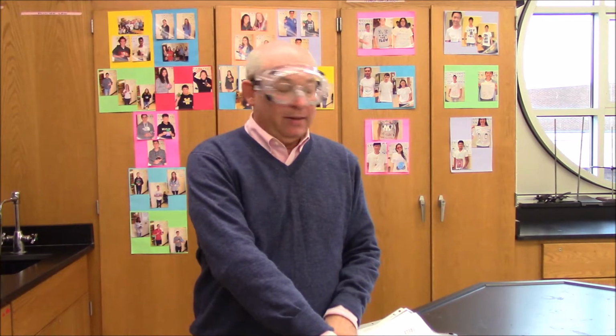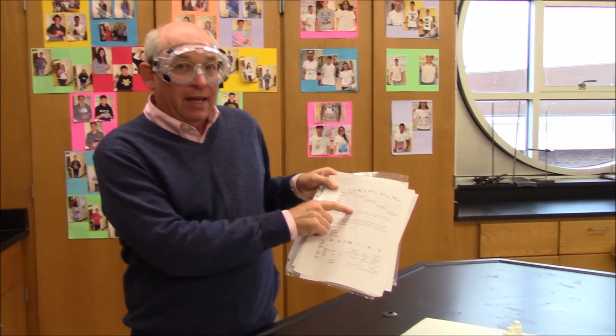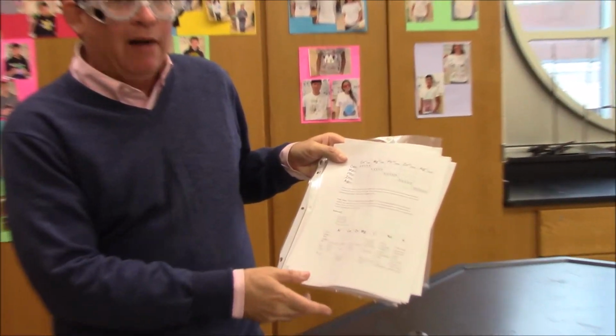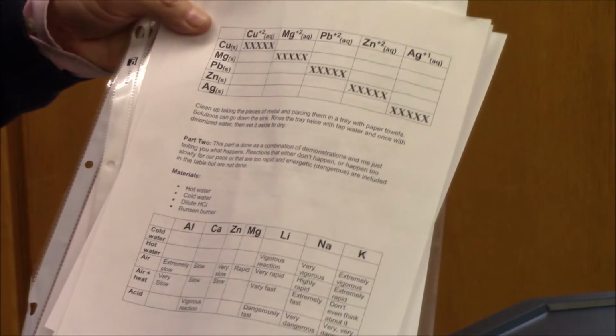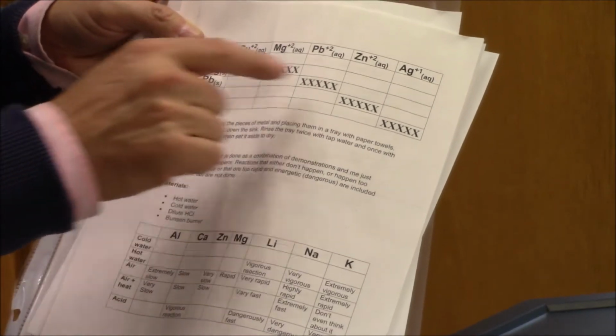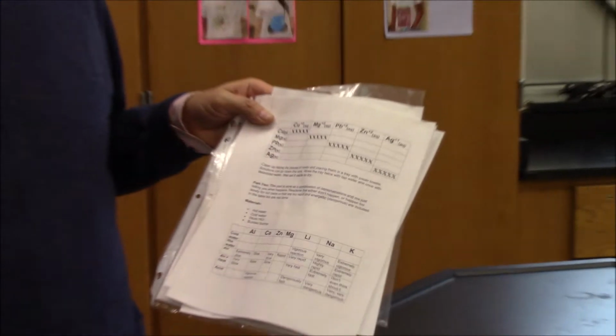So today we're going to look at an activity series of metals lab in which we're going to develop an activity series rather than look at one and use it. And it should match the handout you have. So what you'll see in a minute is that the trays have been set up to match. And what we're really interested in is, did a reaction happen or not? This is a purely qualitative lab.